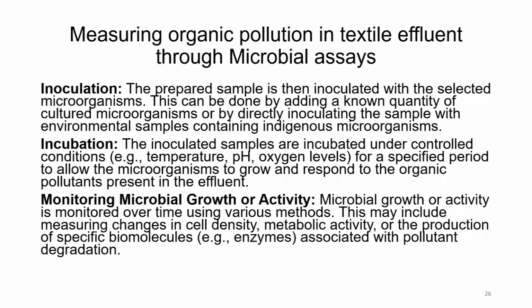Incubation. The inoculated samples are incubated under controlled conditions, that is temperature, pH and oxygen level, for a specified period to allow the microorganisms to grow and respond to the organic pollutant present in the effluent.